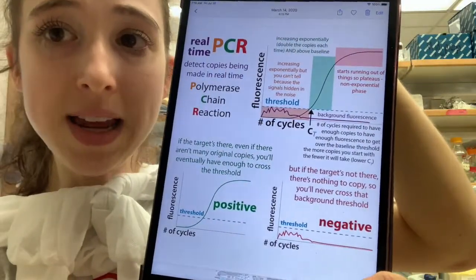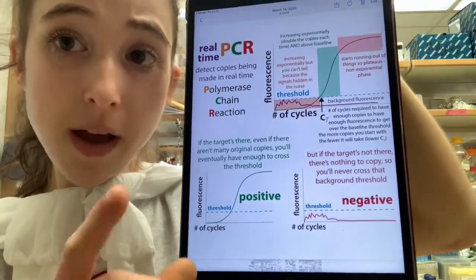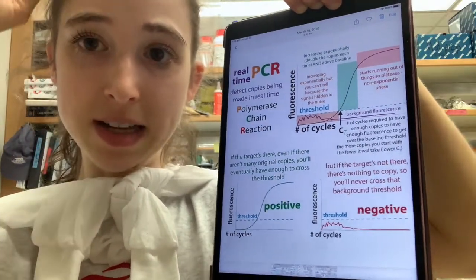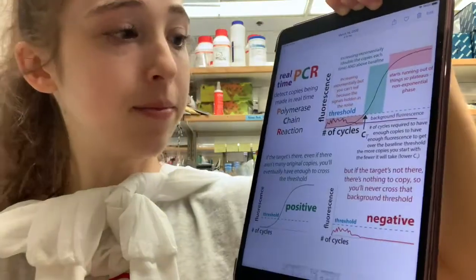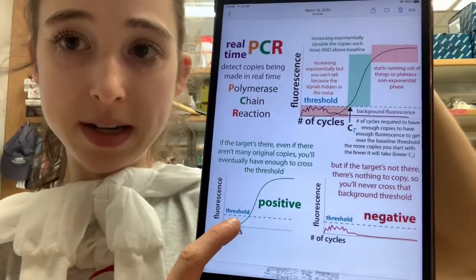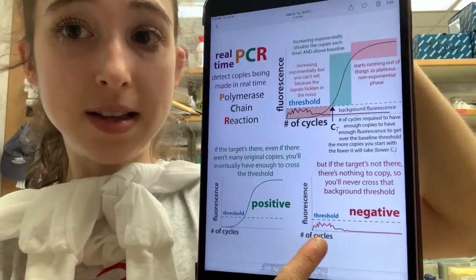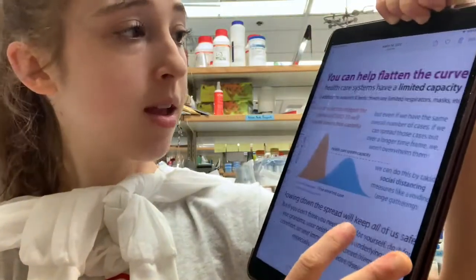And the reason why you have a negative is because the viral sequence isn't there to start with. Remember, you're making copies specifically of the viral sequence. That viral sequence should not be there unless a person is infected or was infected and still has dead viral RNA in them. And so the CT value will be really low if the person has a really infectious and active virus, because there's lots and lots of the viral RNA. And then a high CT count would mean likely the early or late phases of the infection.